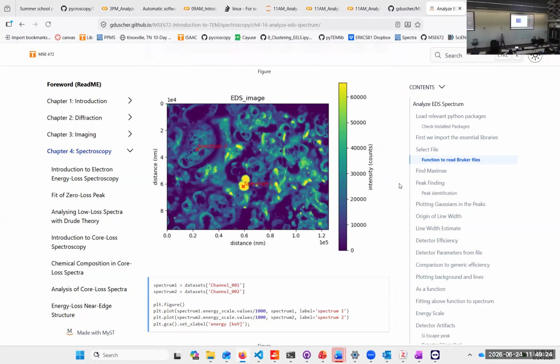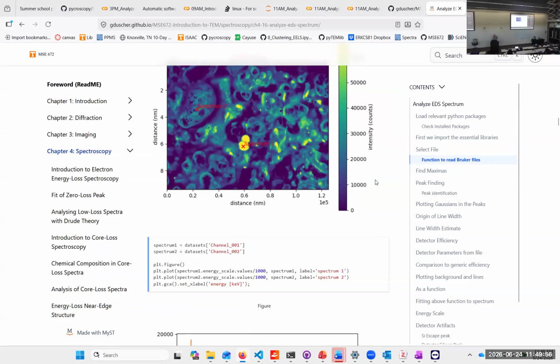So who would have guessed? Nothing too bad for the students of Tennessee. That is organic, 90% chocolate, right? It was put into the SEM because nobody wanted to go up to 90% to do some other tests with them, like melting them in the mouth. So we did some chocolate testing, including laser processing and compression testing and all that stuff.